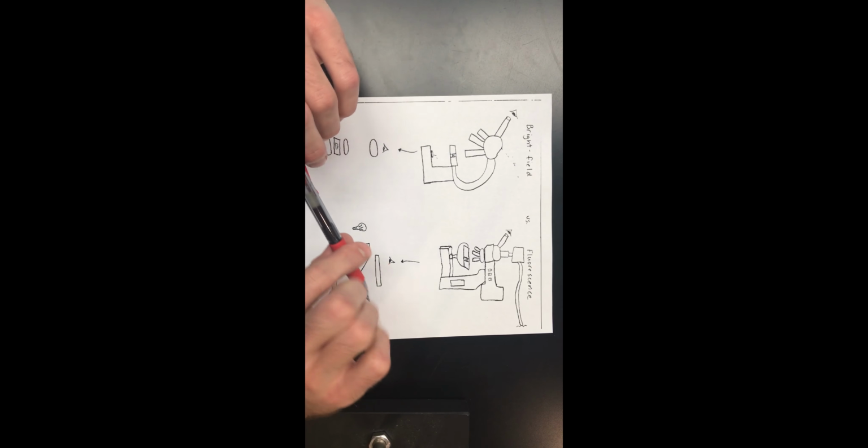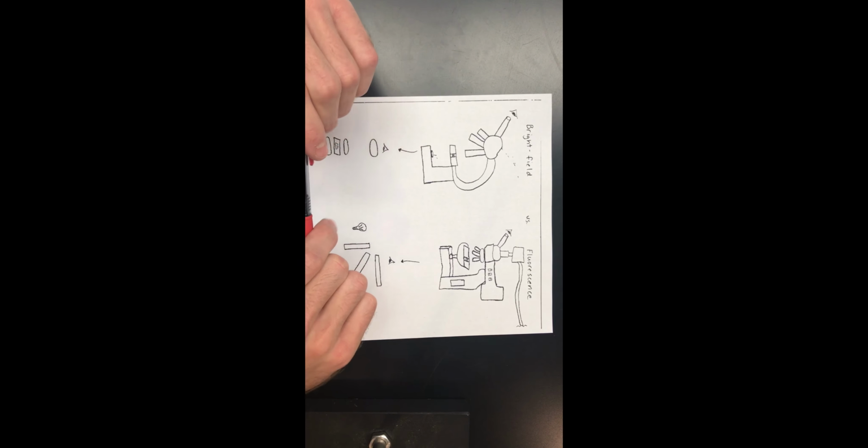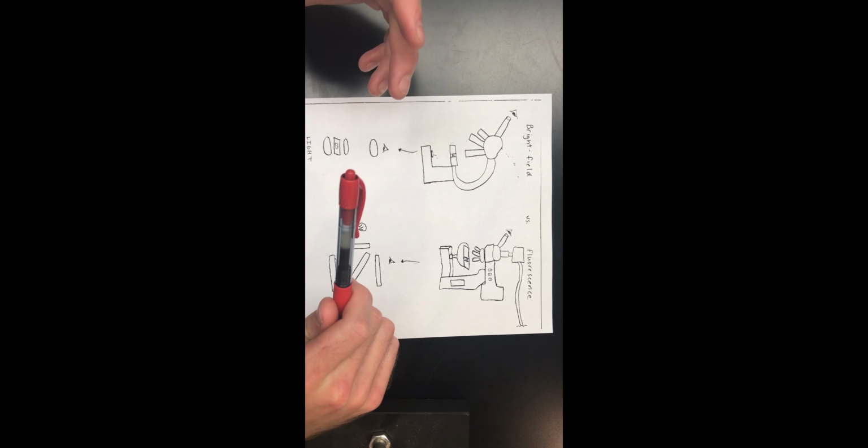Fluorescence microscopy is a technique used to visualize autofluorescent cellular structures, fluorescent dyes, or to analyze the expression or modification of proteins using a technique called immunofluorescence. In order to properly incorporate fluorescence microscopy into an experimental design, one must first understand a few simple but crucial concepts. When comparing fluorescence microscopy to a more traditional method of microscopy, such as bright field microscopy, there are a few key differences that should be noted.